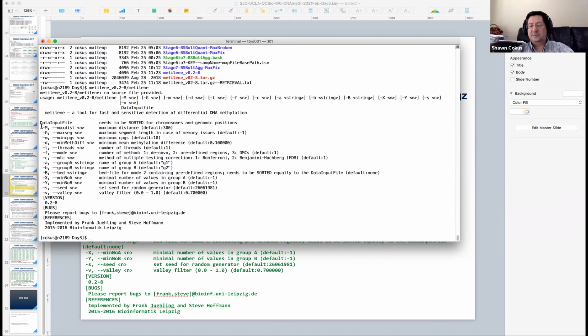That's the easiest possible situation, you guys, right? So if you have an interval in the middle of that blue region, it looks pretty good, right? Because it's like all blue versus all red. But if you made the interval a little bigger, it's even better, because then you've got all blue and all red with more data, right? So TF will like that even more, right? That's even more observations. It's stronger, more power, and the difference is still huge.